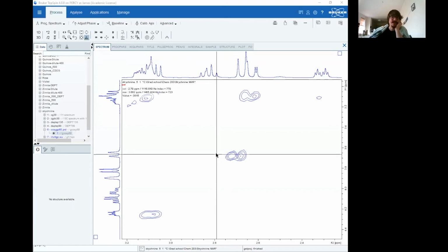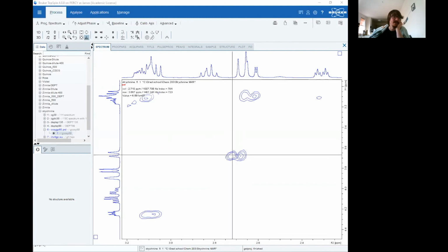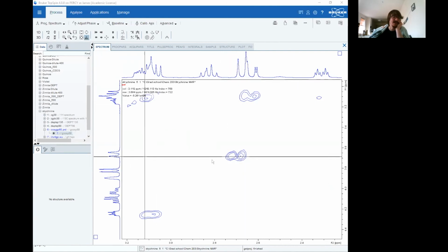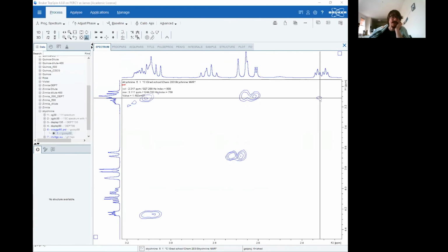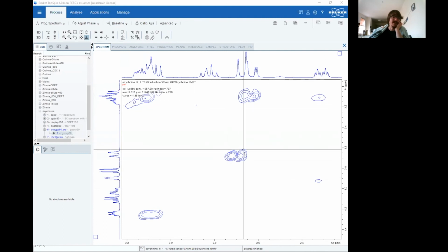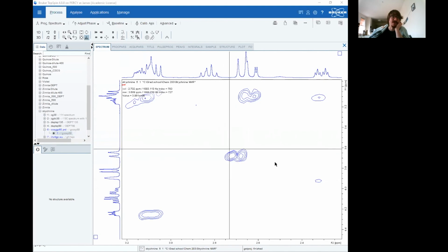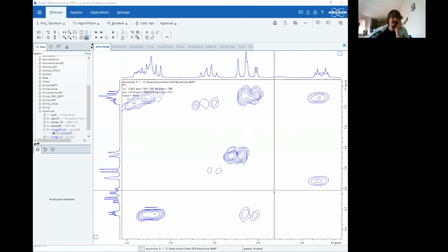Right now I have it relatively zoomed out, and you'll notice that there's multiple contour lines for this particular correlation. I think my calibration is very slightly off, but I think this corresponds to this peak and this corresponds to this peak, but they're crossing with this doublet. You'll notice this doublet of triplets is rather short in comparison. You can tell there's only the one contour line. If I start to zoom in, you'll see weaker correlations start to pop in on their own. But this already has several contour lines indicating that this is a steeper climb. So this is already a much taller peak than this is as I start to bring in the weaker correlations. Does that make sense?